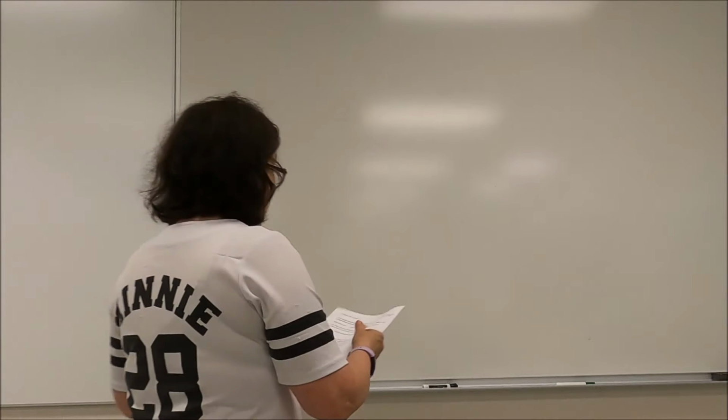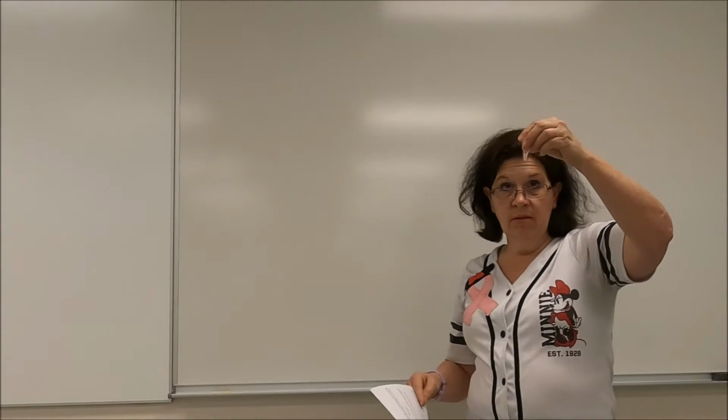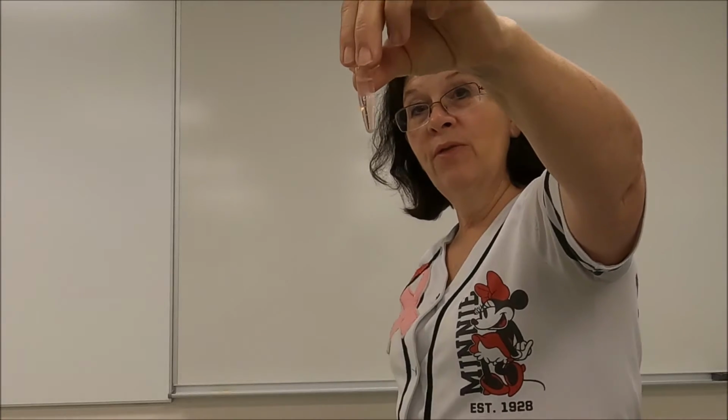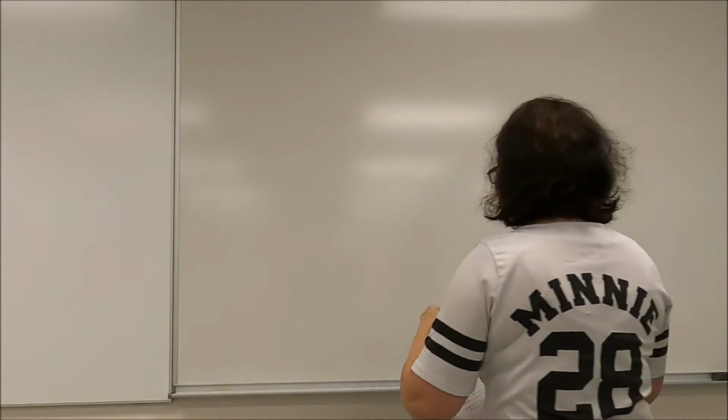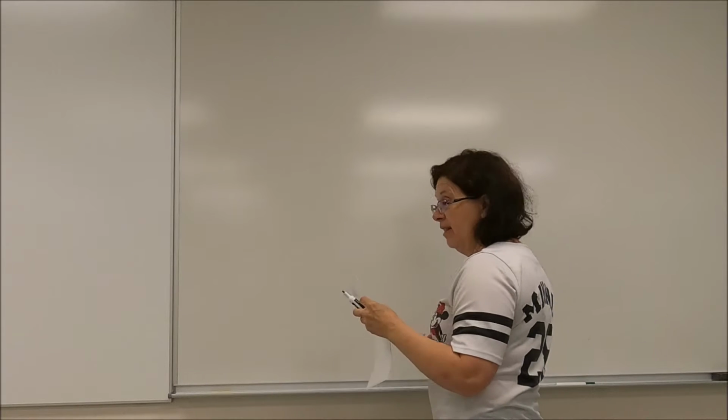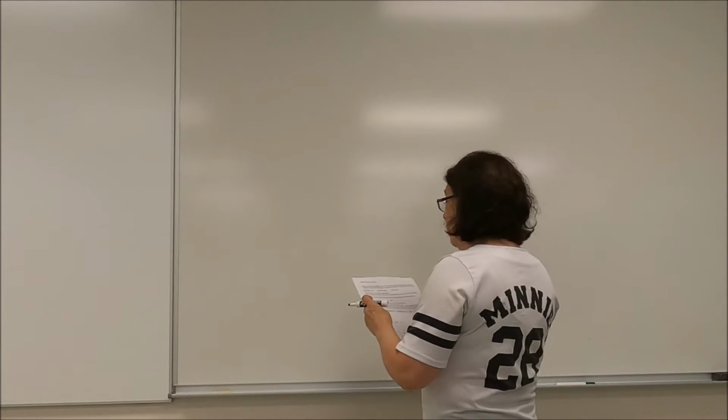Hi guys, welcome to experiment number 6. In this experiment, we're going to determine the Ka of a weak acid. You're going to start out with a little Eppendorf tube with a liquid acid in it. It's 100% acid. In its pure form, it's a liquid.